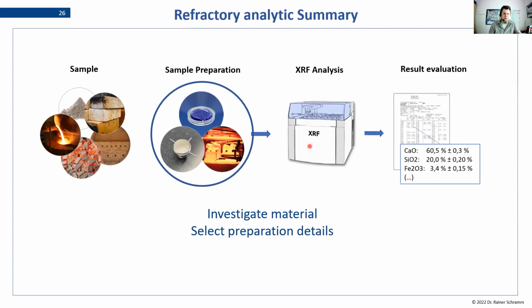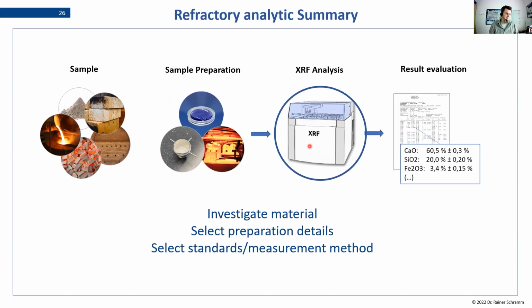The preparation details, again, you've seen the list of the different refractory materials, and there is lots of details here. So it really comes out to trying. And yeah, feel free to ask us about some advice, because we've been doing most of those mistakes and solved them. So we can definitely give you a tip or two. Standards and measurement method is what CRMs are available. Do we need to go synthetic or do we need to trick?